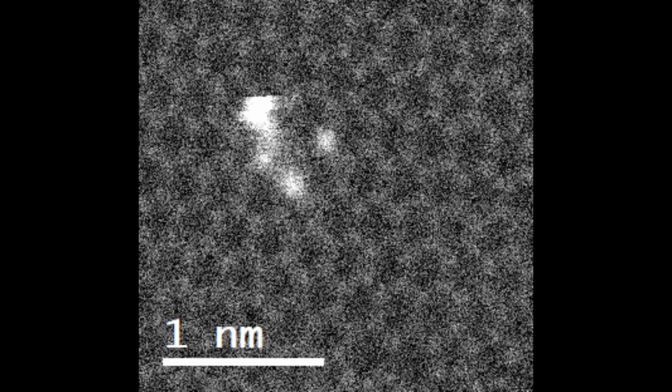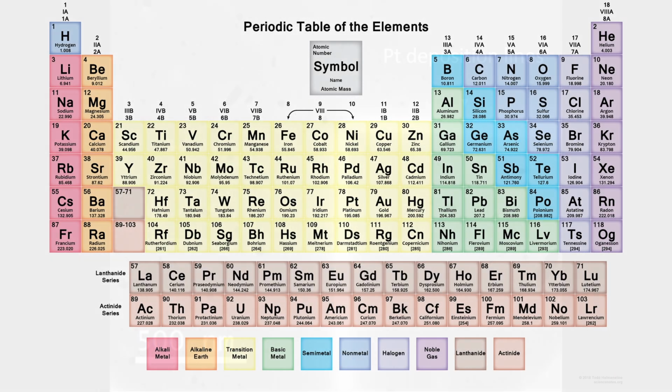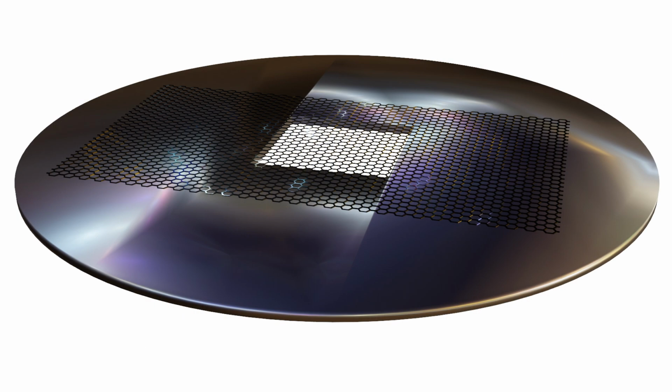Initial demonstrations were performed with silicon atoms that happened to be in the contamination on the graphene surface. This was extended from silicon atoms to platinum atoms, which were intentionally deposited on the graphene surface using focused electron beam-induced deposition. Here, we extend the technique to chromium atoms and examine how these atoms interact with the surrounding material and the electron beam. We begin by transferring graphene onto a perforated TEM grid so that some areas are freestanding.